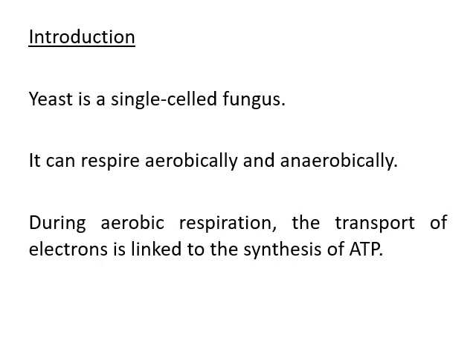So during aerobic respiration, we now hopefully all understand that this means that all 4 stages of respiration are allowed to continue. So we have glycolysis, and then we are able to move on to the link reaction, Krebs cycle, and then finally to the electron transport chain, which involves oxidative phosphorylation. Now this is the important bit. It's this movement of electrons that we are going to take advantage of in this investigation.